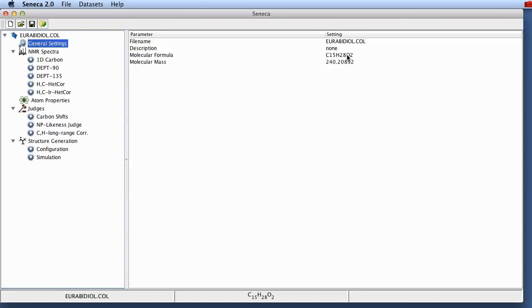The molecular formula is absolutely essential for Seneca. You need to have this information for example from a high-res mass spectrum because all the other computations are based on the molecular formula.